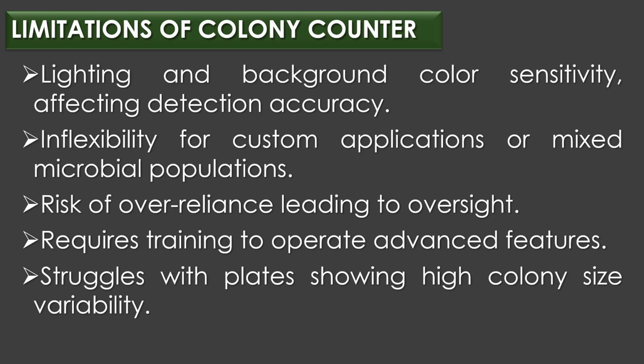Lighting and background color sensitivity affecting detection accuracy, inflexibility for custom applications or mixed microbial populations, risk of over-reliance leading to oversight, requires training to operate advanced features, struggles with plates showing high colony size or colony size variability.